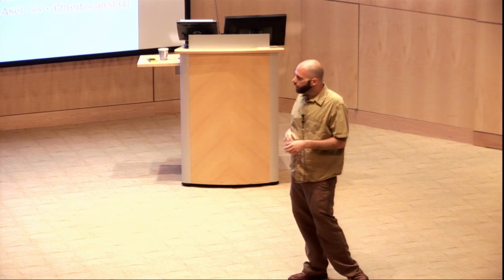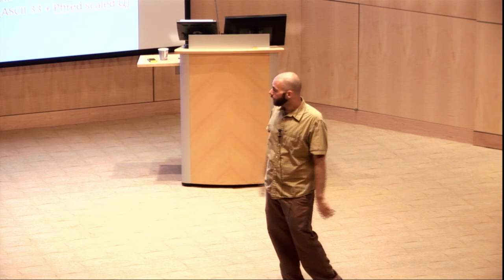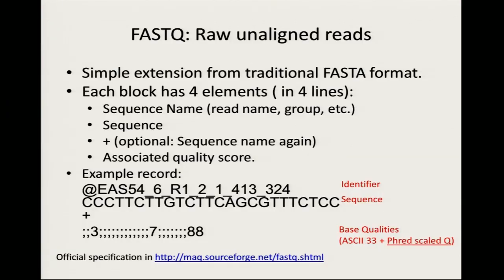And so this is a special encoding to tell you, a base quality score is like telling you how confident the machine was in the base call. So maybe it called a C, but it was only 95% confident. And then it called the next C, and it was like 99.99% confident, right? And so you encode that probability using this special thing called Phred scale into just a single character, and then you put that in there. On the next slide, I'm going to explain what Phred scaling is, so don't worry quite yet. But does everyone see how this is a string of bases and then a string of probabilities right underneath it? It may not look like probabilities, but all it is is a probability.